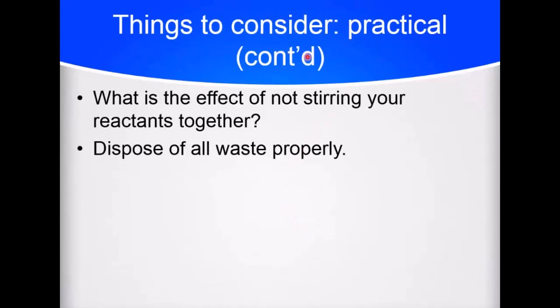Then other things to think about practically. What would happen if you didn't really stir the stuff together? It might not have contacted, the two components may not have contacted each other, and you might not be able to tell if a reaction occurred because you hadn't stirred it. And of course, you need to dispose of all your waste properly.